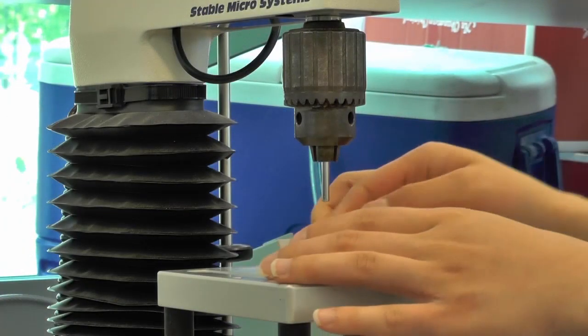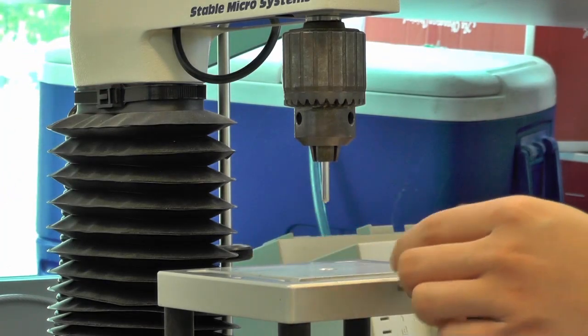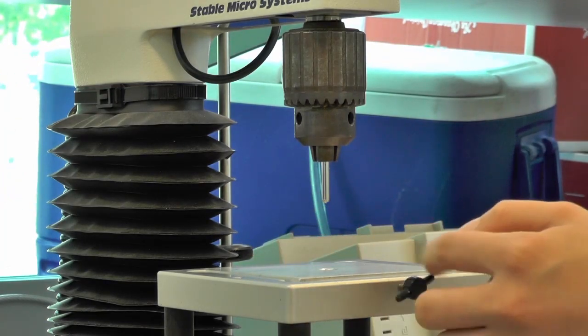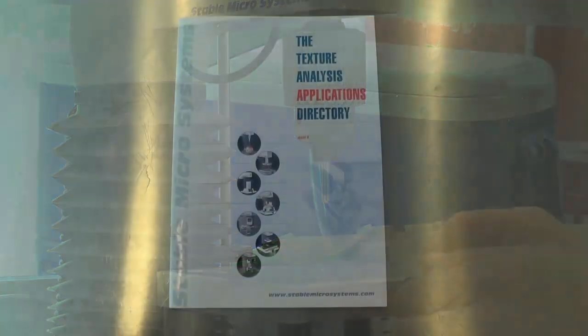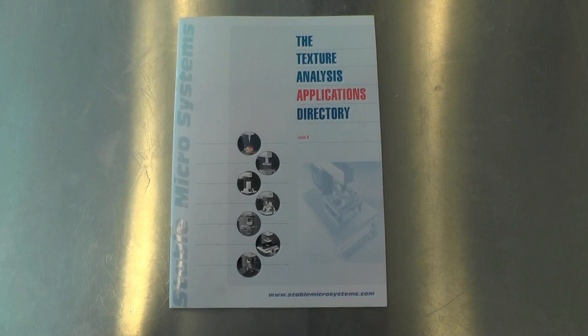Also make sure you use the right platform depending on the type of probe you're using based on your chosen test. You can also refer to Texture Analysis Applications directory for details on platform selection.